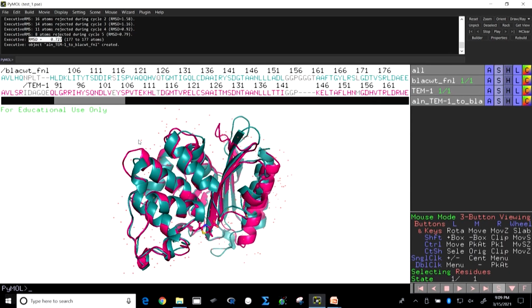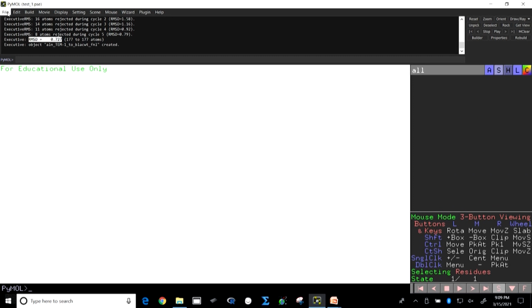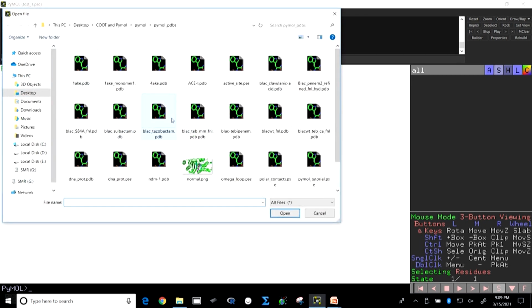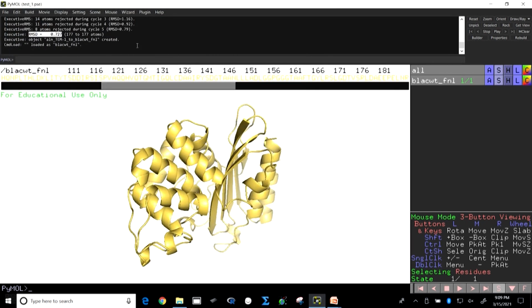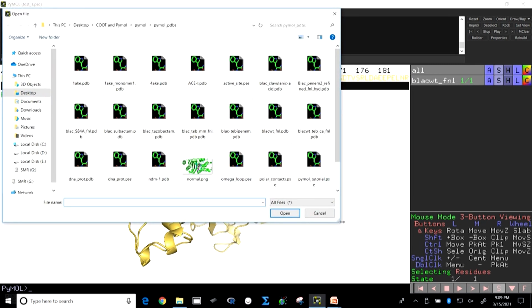To demonstrate that, we again come back to the screen and now we will see the mutants. We will also compare between the wild type and the mutant, so that we could have a comparable picture. As I told, we could have made the picture in WinCoot. Why did we not do it? Because when we do that in WinCoot, we cannot get a nice, high resolution picture.